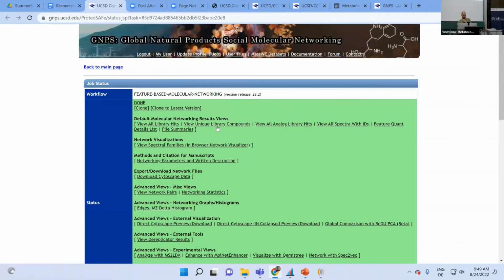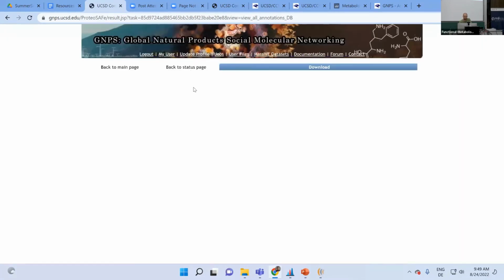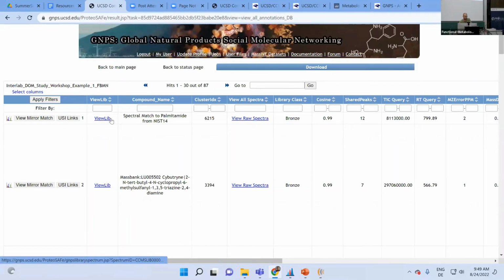So again, here, if I go to view library hits, and then go to the view library here.